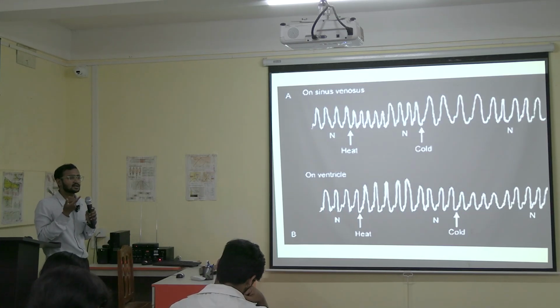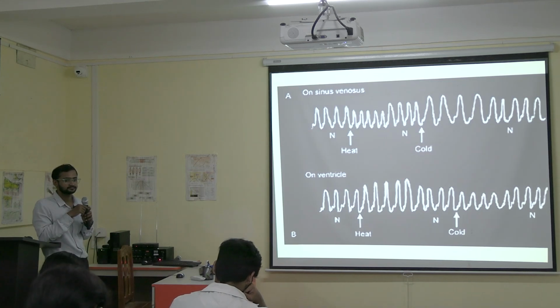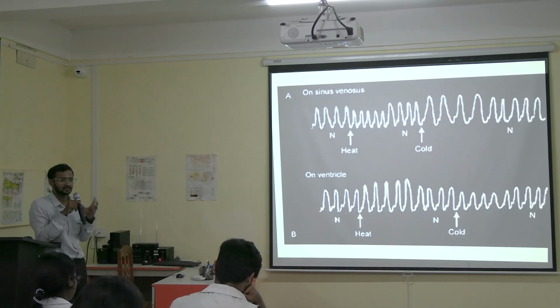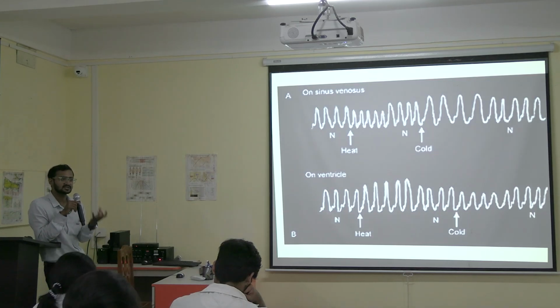And what is the inotropic effect? The force of contraction through which the heart contracts. If it is more, then we will call it an increased inotropic effect. And if the force of contraction of the heart is decreased, then we will call it a negative inotropic effect.